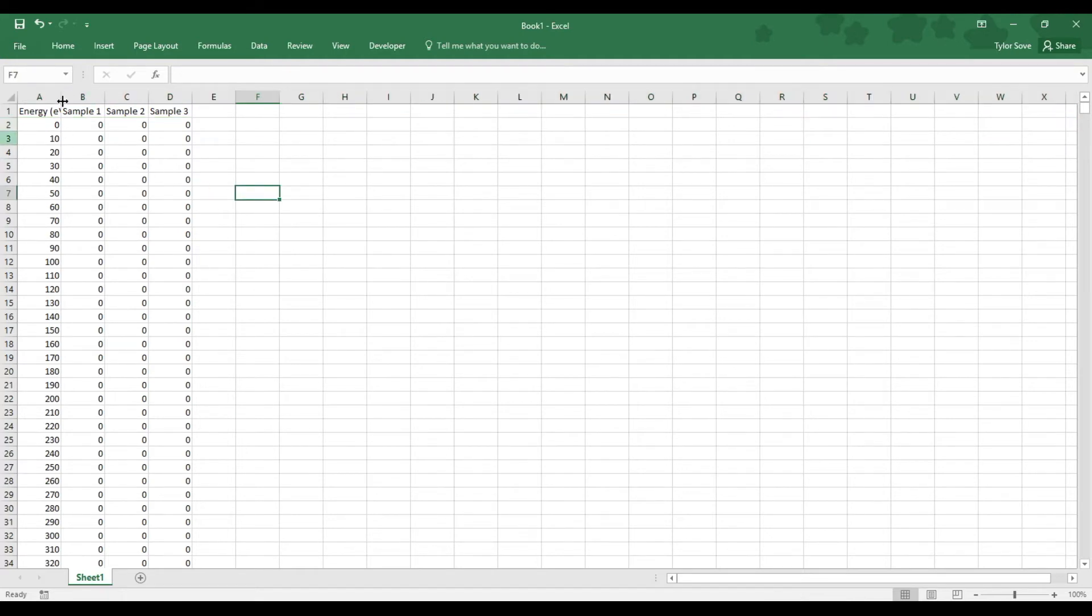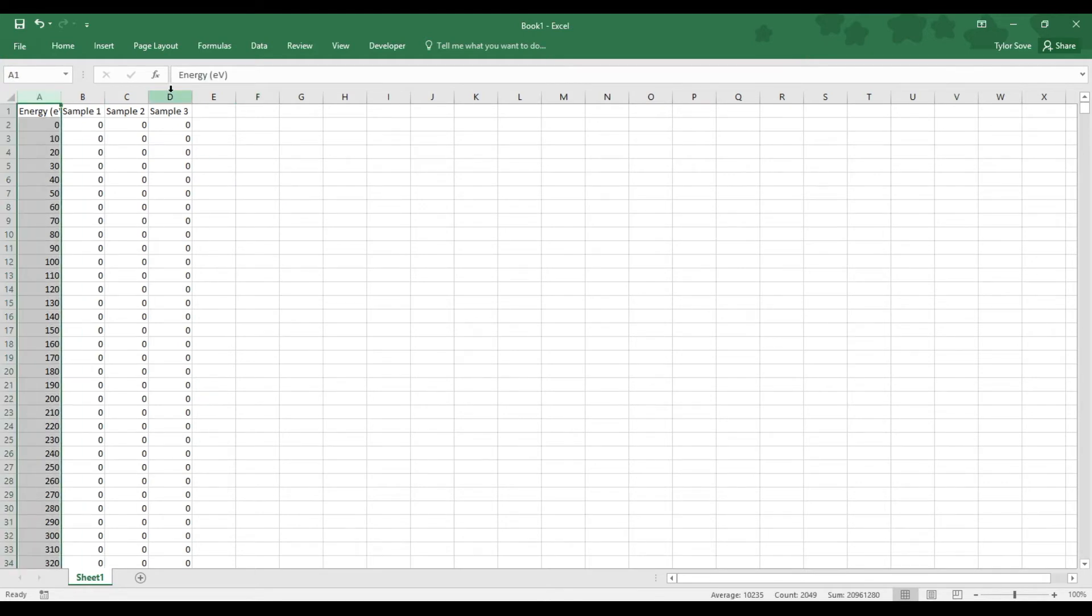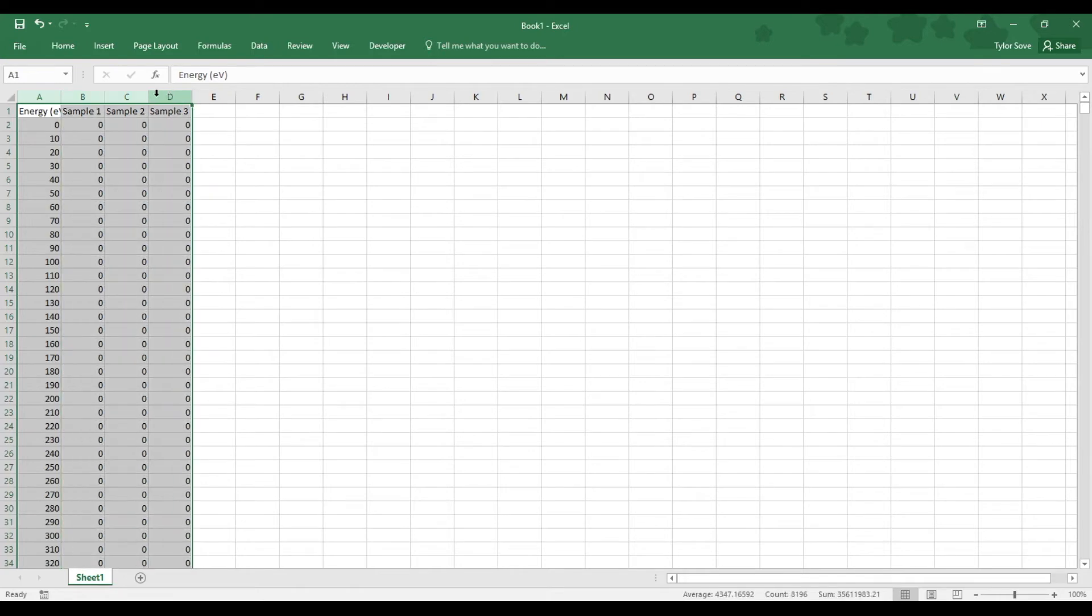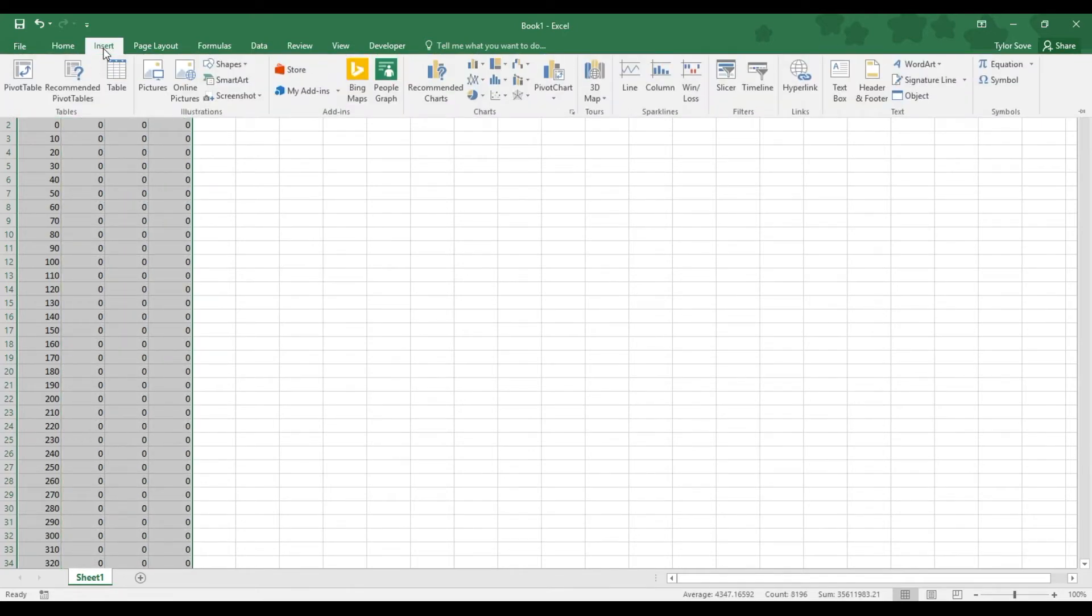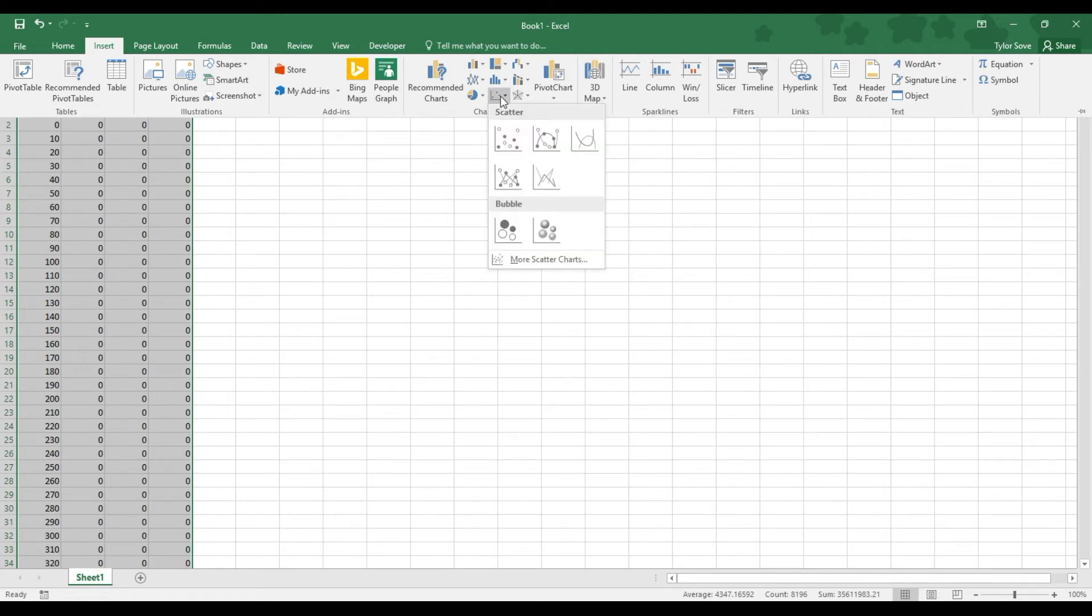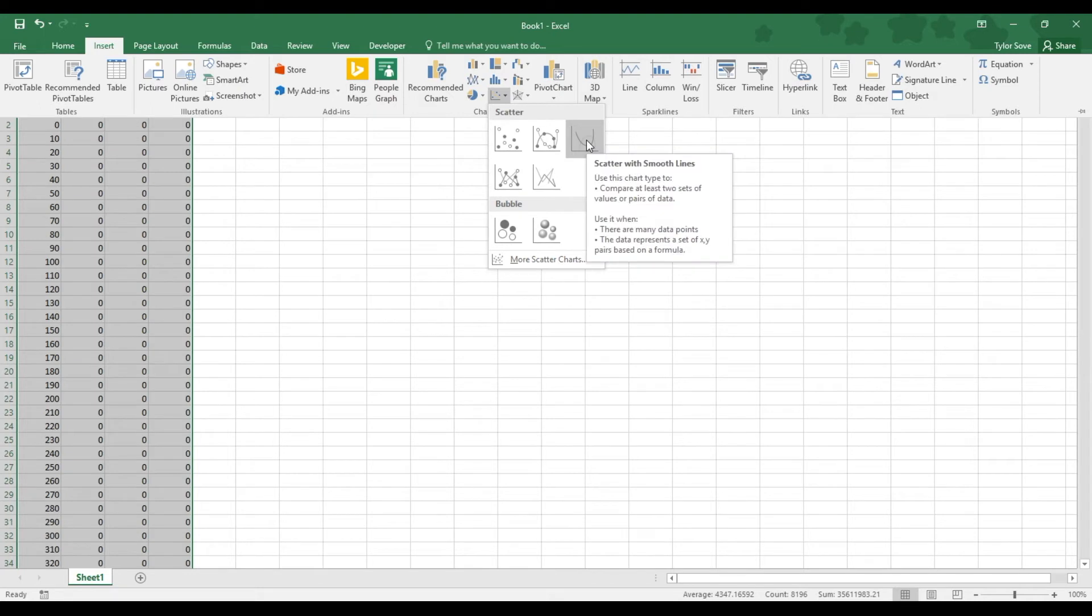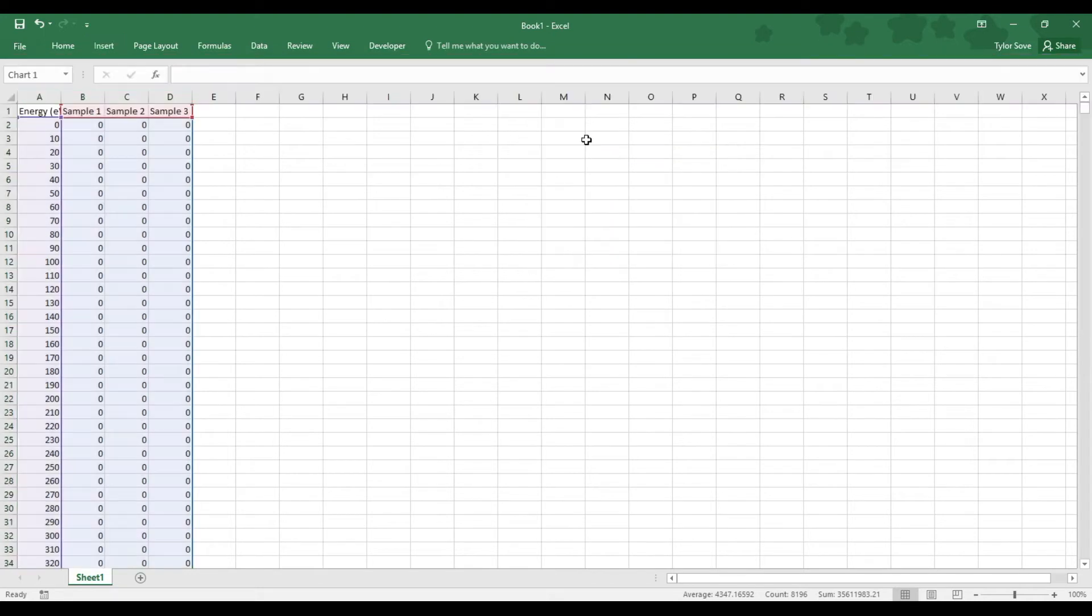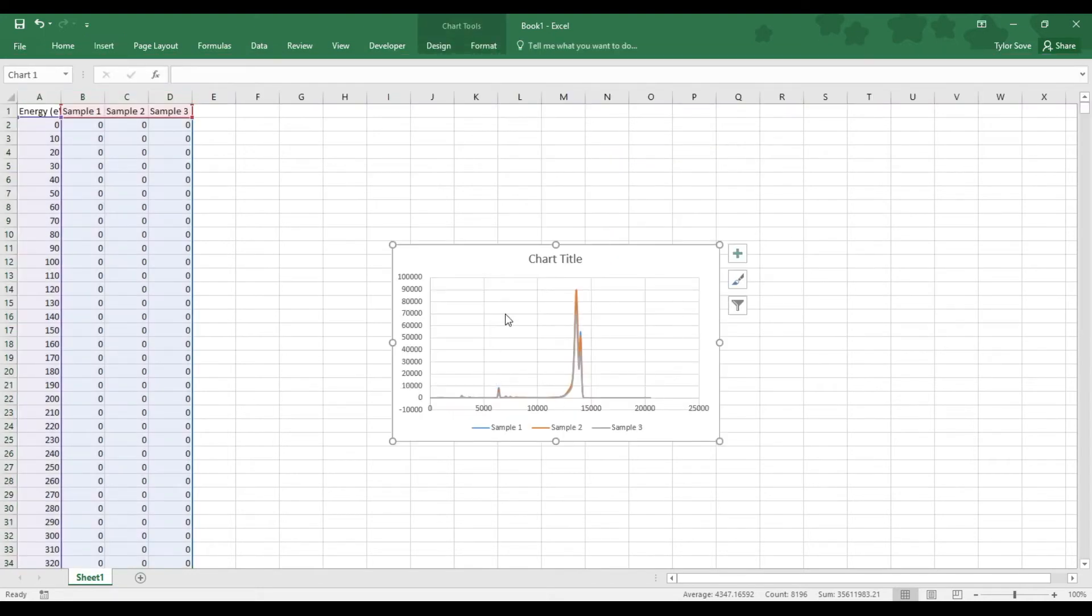Now we're ready to create an XRF graph from this. We can select the column A header, hold shift as you select the last column header of your samples. For me it's column header D. Go to Excel's insert tab, go over here to the right to the charts drop-down menu for the insert scatter or bubble chart, and choose the scatter with smooth lines option, and that will create your XRF graph.